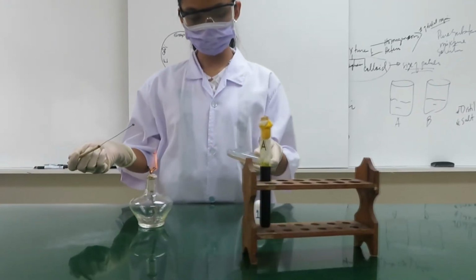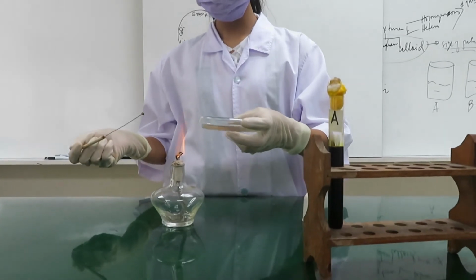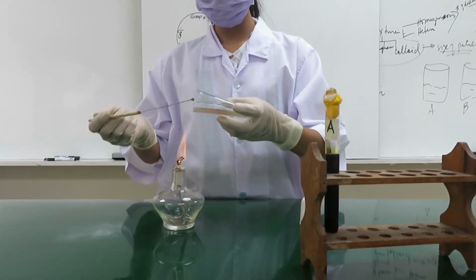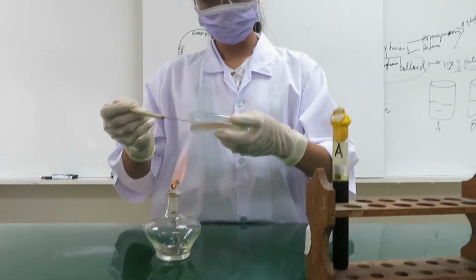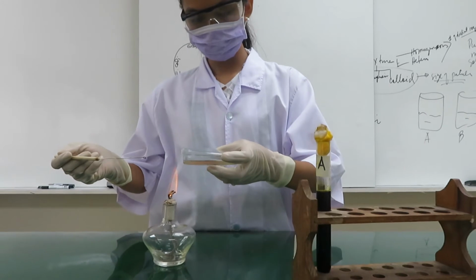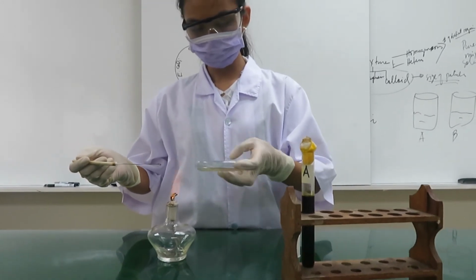4. For the first quadrant, by holding the loop like a pencil at a 10 to 20 degree angle to the medium, spread the sample at about 1/4 of the surface of the medium using a rapid, smooth, back and forth motion. Do not forget to flame the edge of the petri dish before and after streaking.